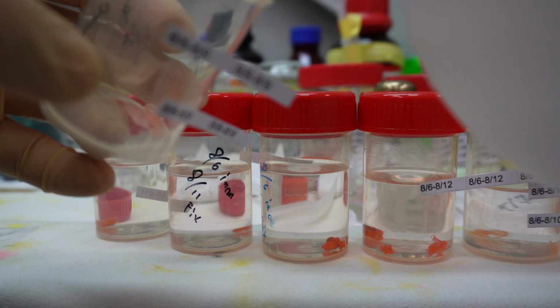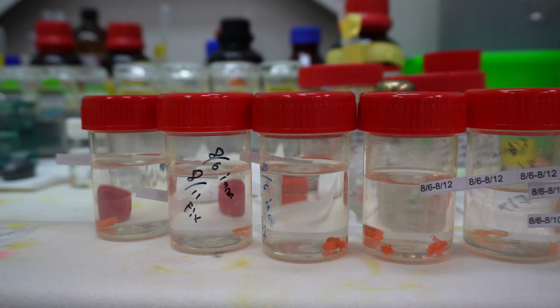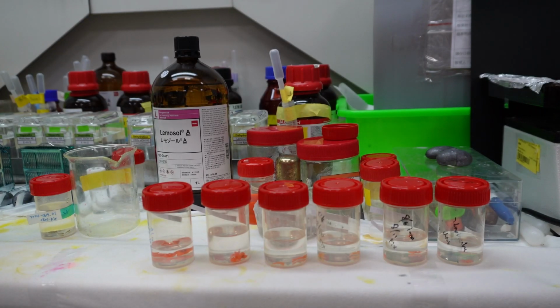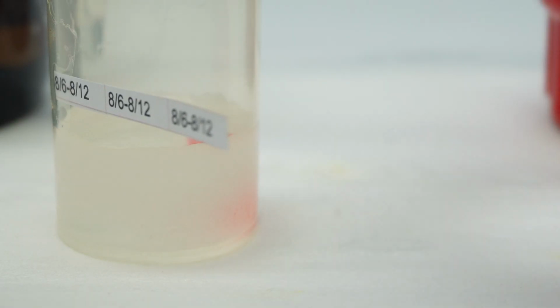Once it's fully dehydrated and 100% ethanol, you need something that mixes with both ethanol and the melted paraffin wax you'll use next. A transition step. Right. The guide mentions using a xylene substitute. Lemosol A is the example given. So ethanol out, Lemosol A in, then Lemosol A out, and you transfer the embryo into melted paraffin wax.